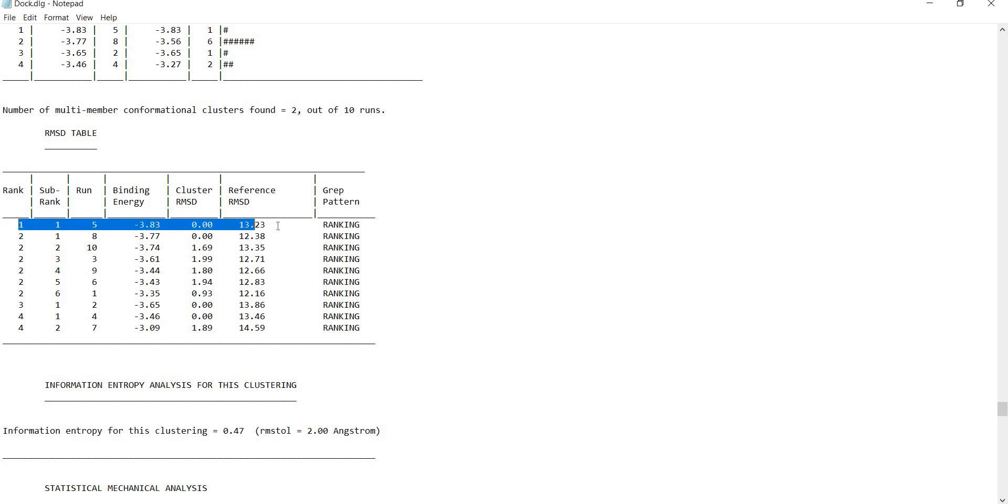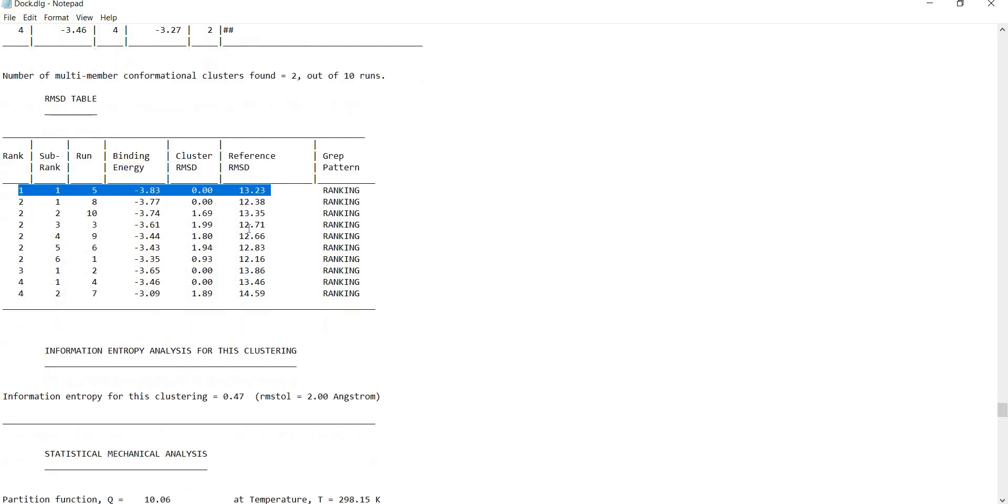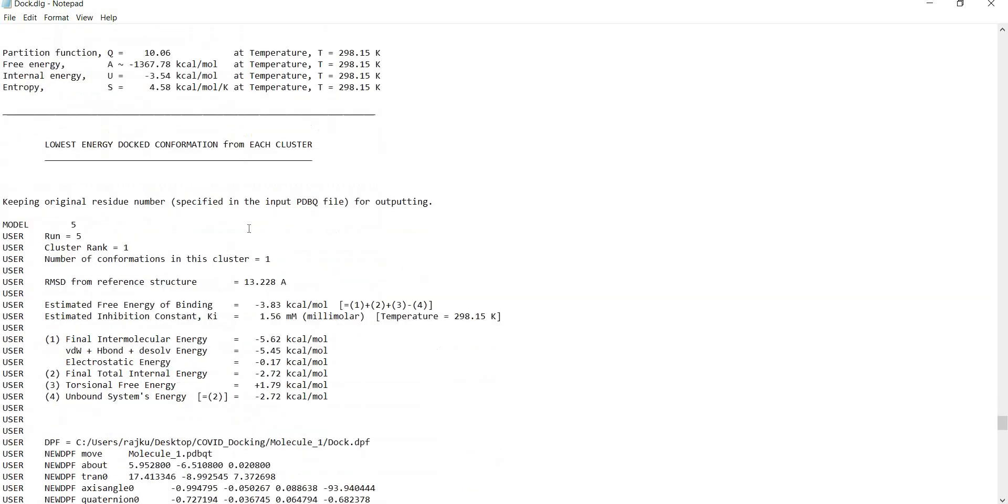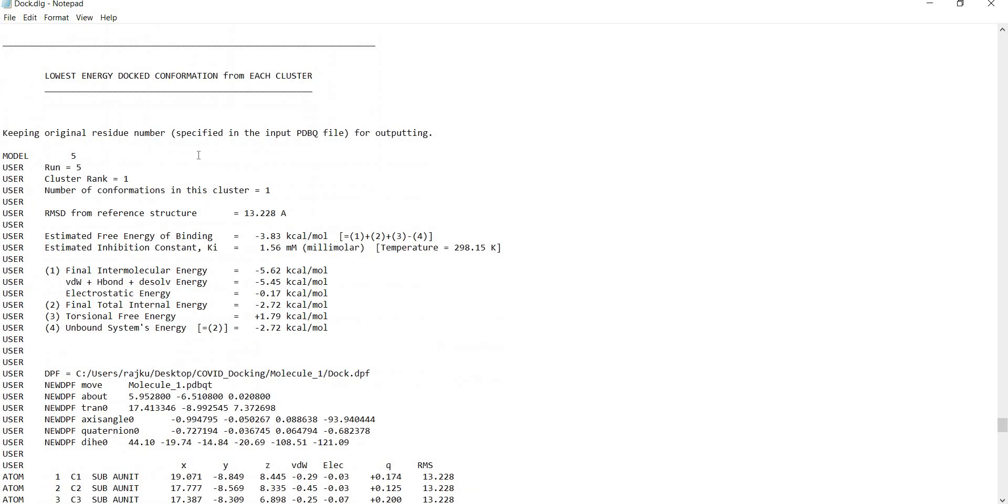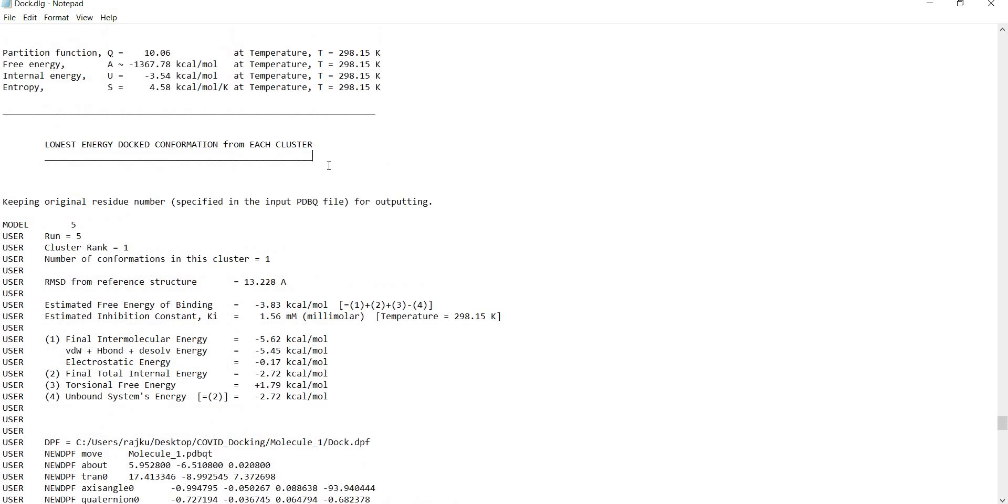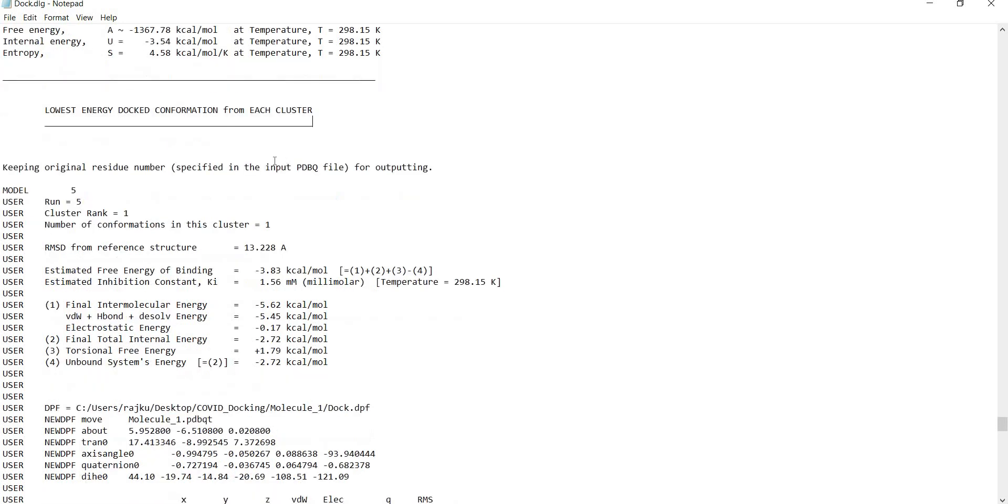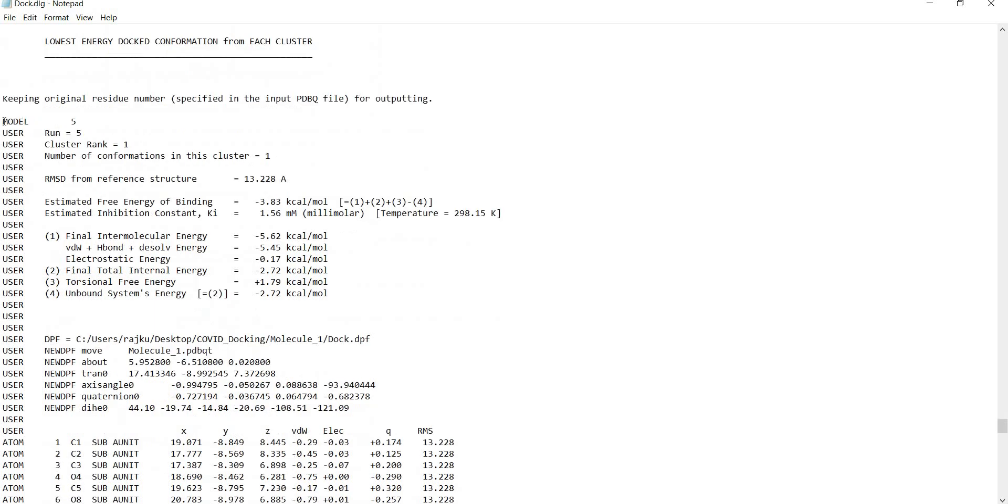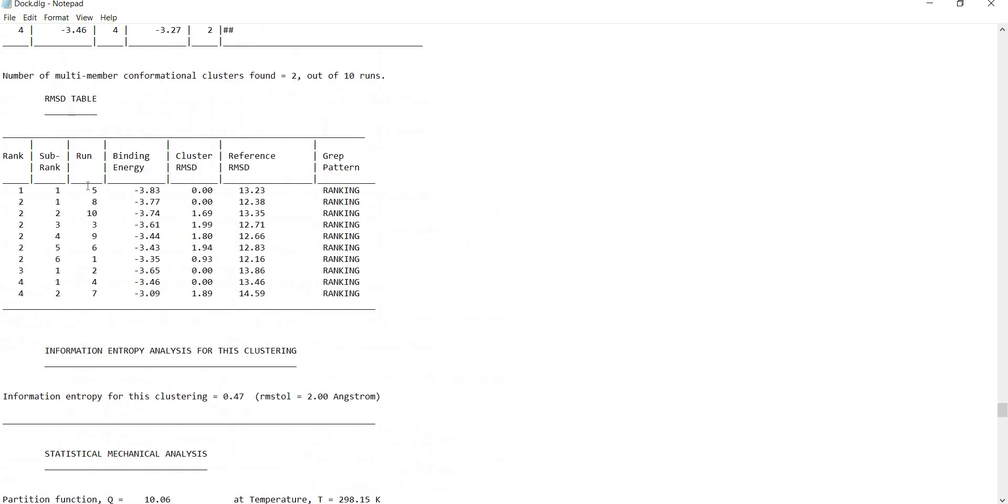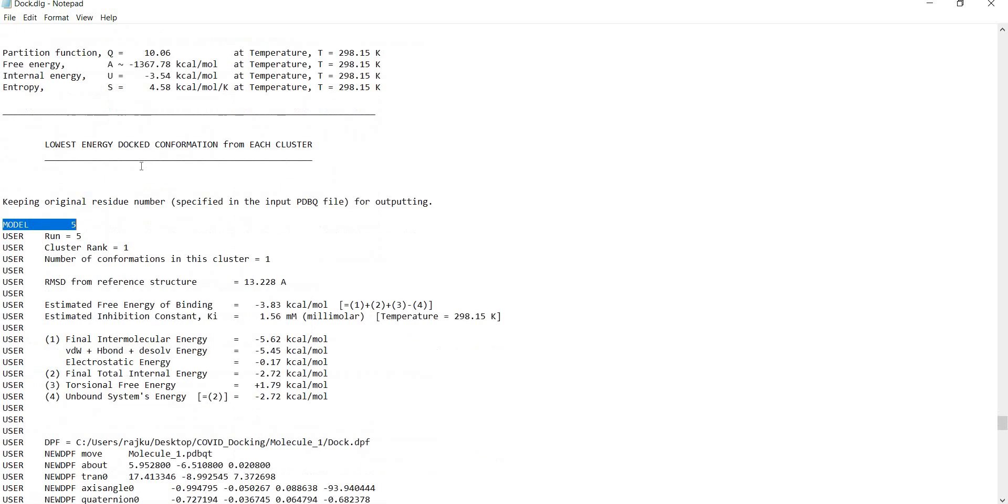You will see the conformations right here. Model 5 is the best pose in our case, so I will start selecting from here and look for the model.